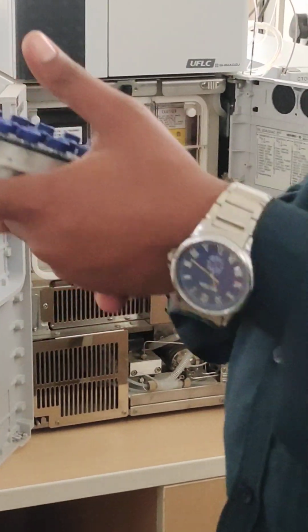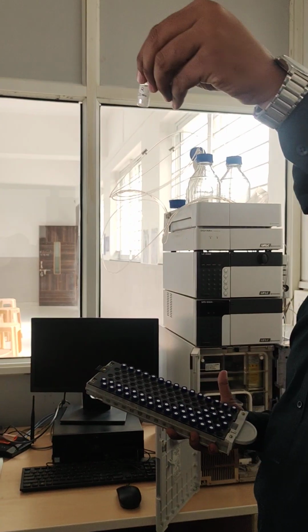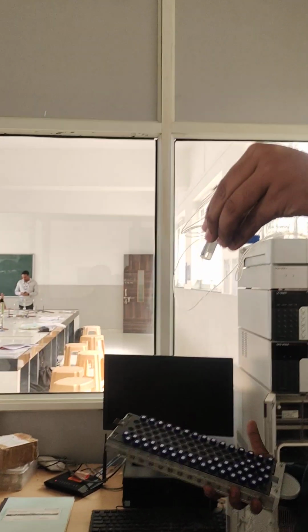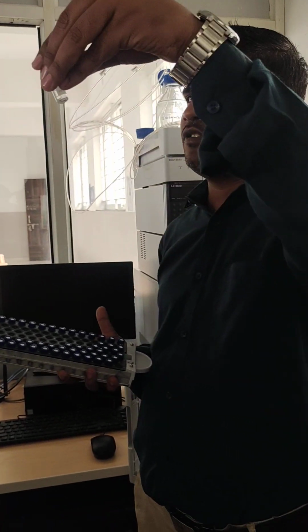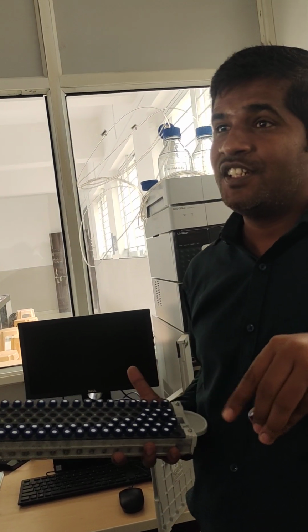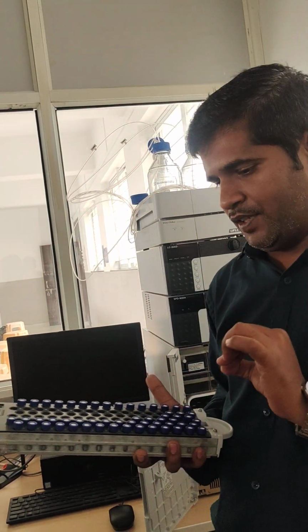Okay, so I hope you are understanding. We will keep our sample in these particular vials. It is a 1.5 ml capacity vial. So how many microliters of solution are there? 1500 microliters. How much? 50 microliter injection volume of sample we can keep here.